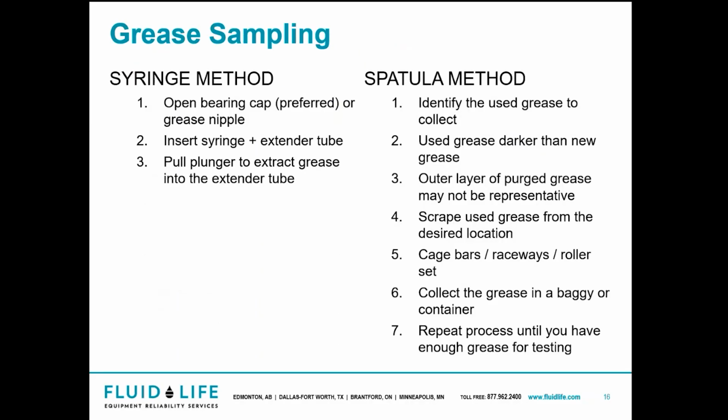Now we have a couple of ways we can sample grease. We can open it up and pull it out with a syringe or spatula, so basically you're scooping it out. A syringe is obviously preferred for in-service, whereas a spatula is used if you purge the grease out or you disassemble it, and you can grab the grease from there.